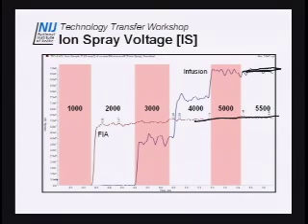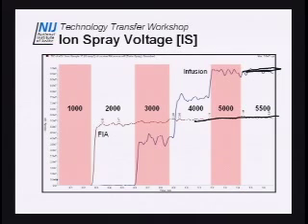It's like 4, 0, 2, 0. There's nothing there. 1,000 volts is not enough to extract ions from the droplets. The droplets are being formed because I've got gas flowing, or I'm nebulizing. Stuff is being squirted out of the needle, but there's not enough voltage to extract ions. You can see when I increase it to 2,000 that all of a sudden, it's just on, and I get, was it 5e to the 7?